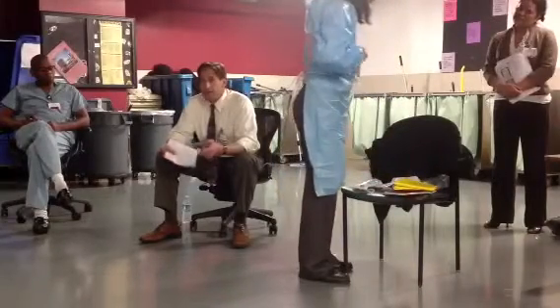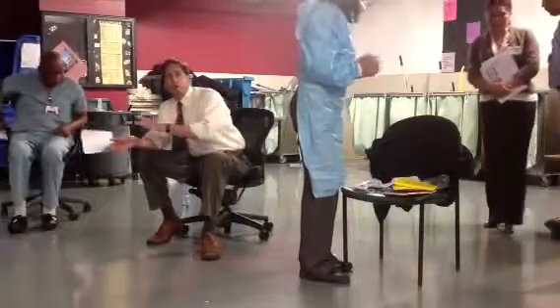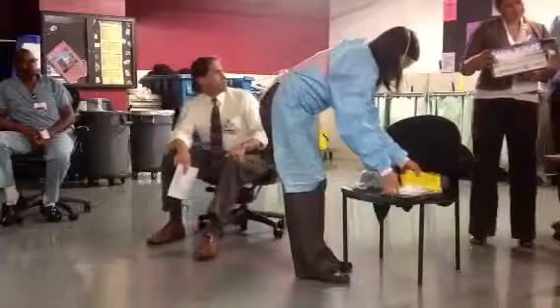And that is the first step, what Kitty was saying, is to make sure nobody goes into the area. Secure that room. Somehow you may have to go do something real quick, come back, and maybe someone has stepped in and tracked it throughout. So securing the area is the first step.